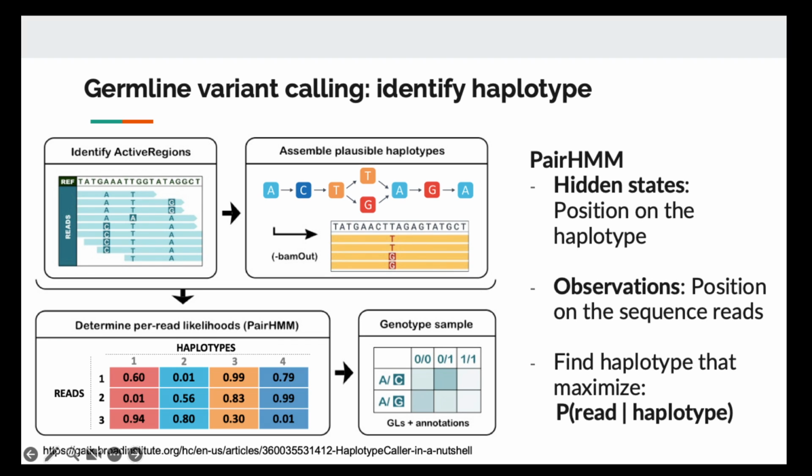So next, we need to use this information, like the possibility for the haplotype, to score, like if we have 100 reads, which of them support the first haplotype, which of them support the second haplotype. And it might not be clear because we have sequencing errors in the reads as well. So some of them might match both, but with different degrees.